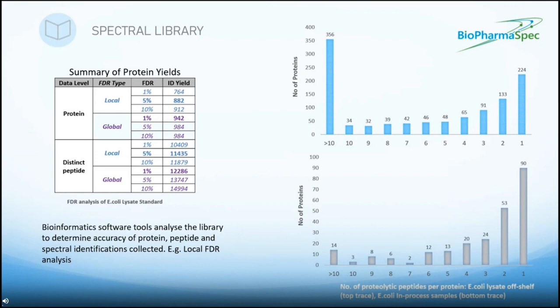And then to the right, we've presented ProteinPilot results from 2 different library searches, just to illustrate some of the parameters that we like to look out for when building a protein library. So in this case, the bar charts both display the number of HCPs that have been observed at different peptide counts. So in order to produce more confident data, we want to see ideally a higher protein total with larger counts, so more proteins with higher peptide counts.